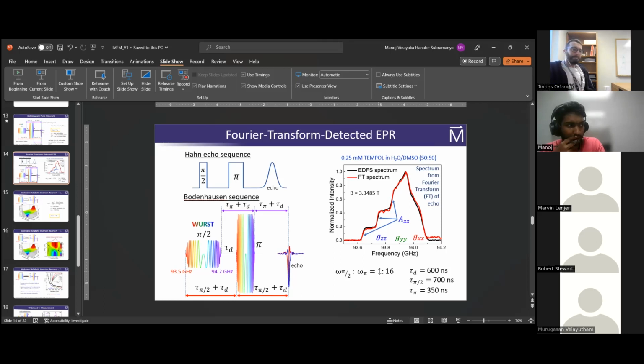For example, for a high spin system, I have used as short as a pi over 2 pulse of 3 or 4 nanoseconds. Okay, it's not extremely short. But I think, if I'm right, in the paper they do mention it's as short as a nanosecond. I see.